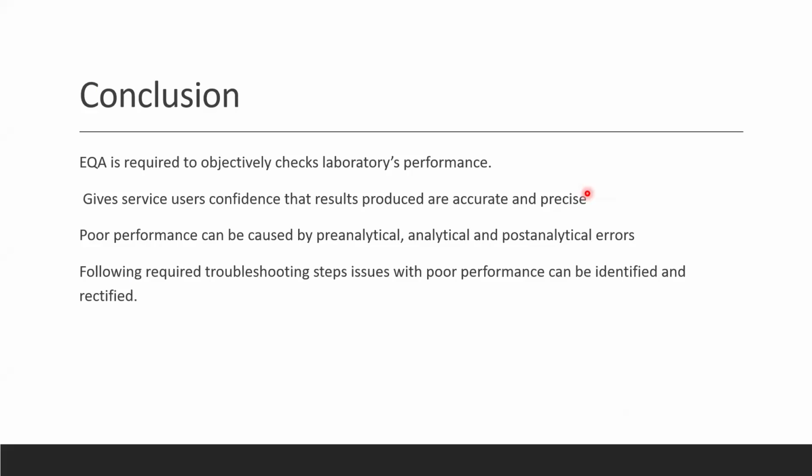I hope I've demonstrated that poor performance can be caused by a range of issues, from pre-analytical, analytical, and post-analytical, and that we have to be quite systematic in investigating the cause of the error. And if we have this sort of flow diagram in place, it will be much easier to troubleshoot and come to the cause of the poor performance result that can then be rectified.